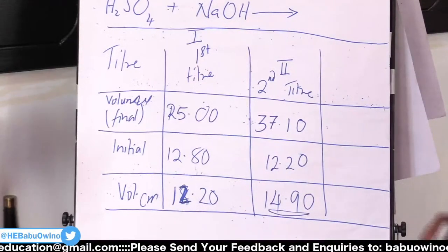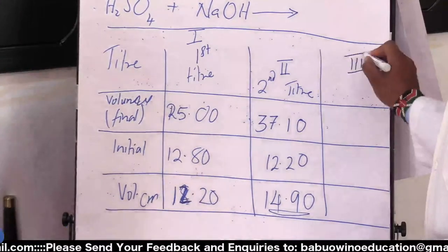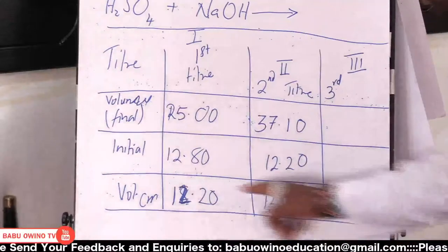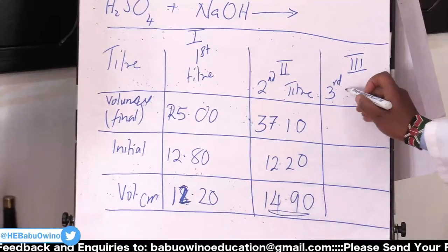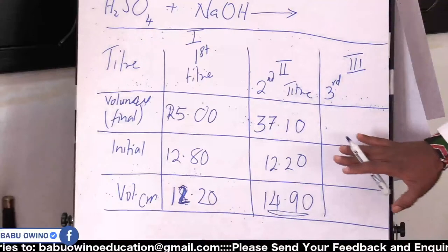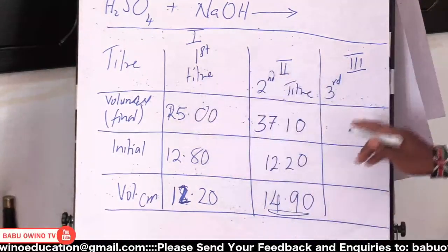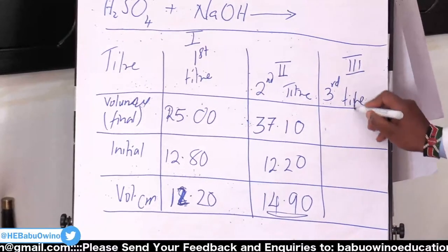What does Aaron tell us? It is important that we look at a third titre. We have been very inaccurate in that case. Here we cannot differ. They can't differ by this much. In an exam, if you ever found this kind of a situation, that tells you are wrong. You've made a mistake in one of the two. So we now see what happens with the third titre.